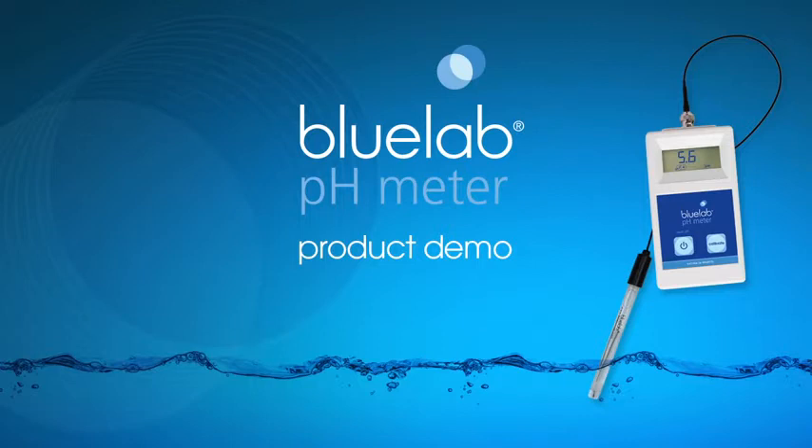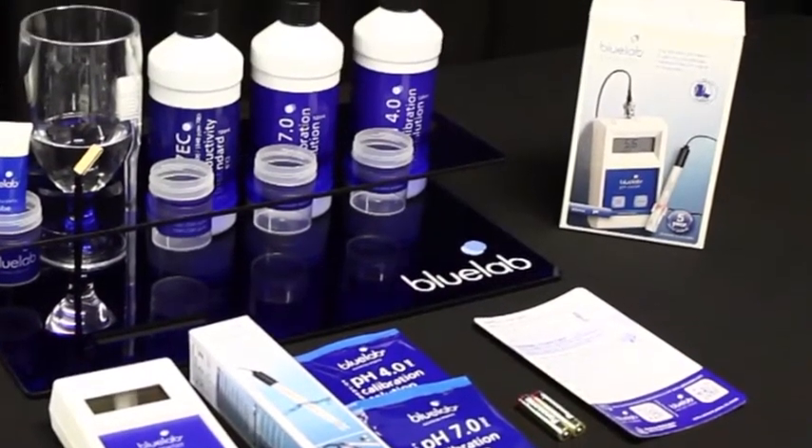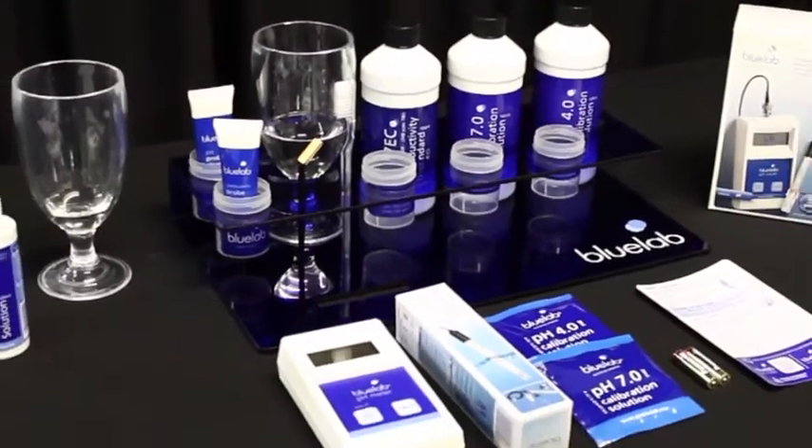Hello and welcome to Bluelab's official video on how to use the Bluelab pH meter. We will show you how to set up the meter for the first use, calibrate the pH probe, and take readings. We have tips for care and storage at the end of the video.